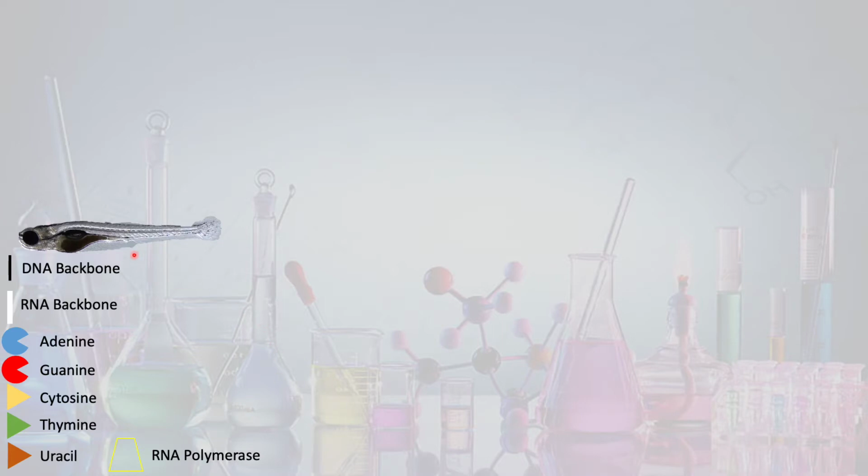To begin, we have our model organism over here that we are using in lab, the zebrafish. So we'll be exposing these guys to different kinds of compounds for a specific length of time post-fertilization. We'll talk about this in lab. And when it comes time for us to analyze and quantify the messenger RNA for our genes of interest, it's helpful to review the process of RNA transcription very briefly.